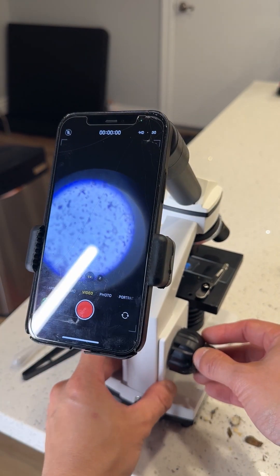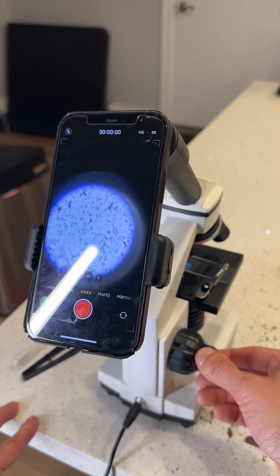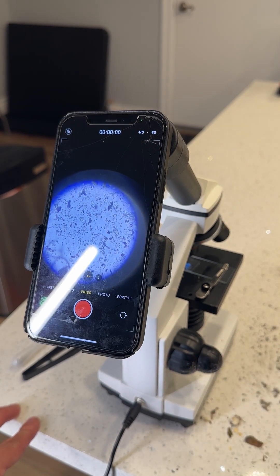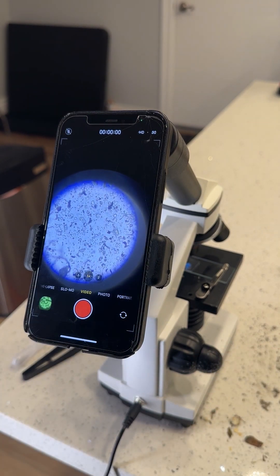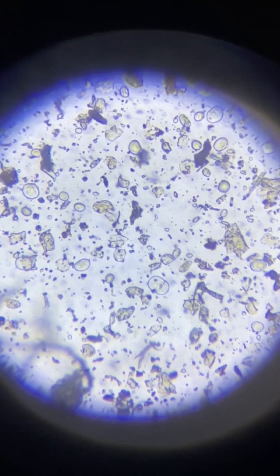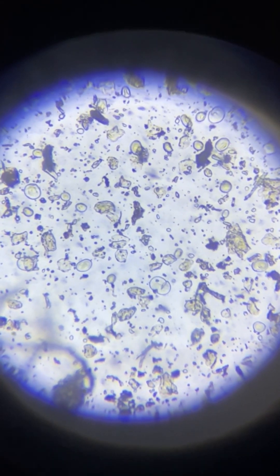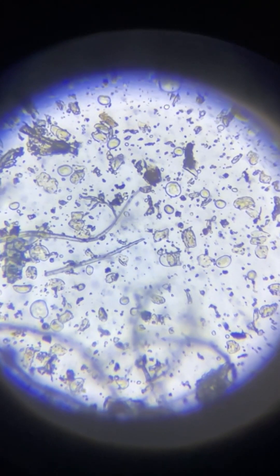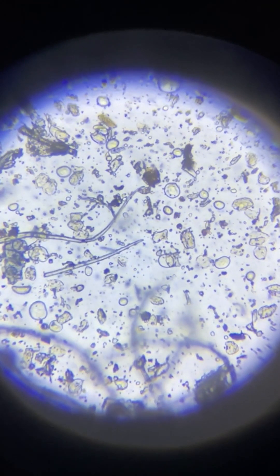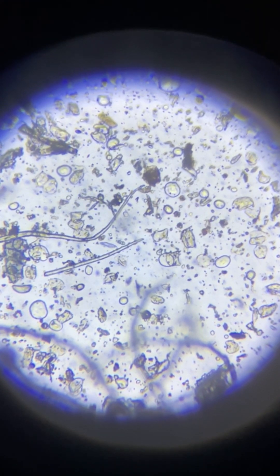Let's put in this dust. Now we're going to get to work — we see it already. Let's get a little focus in there. Whoo, there's a lot of stuff going on there! Alright guys, now we are in the eagle eye. Let's see if we can find any organisms living inside. Look at that dust — a lot of stuff going on in there.